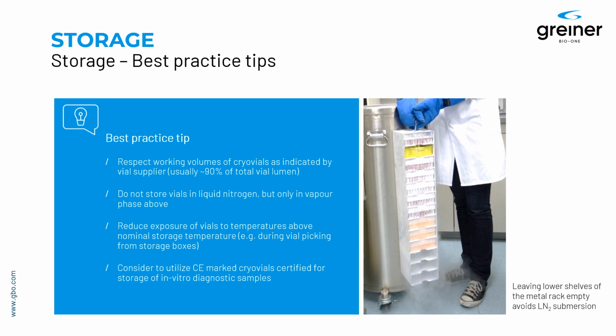And you can even think about automated storage devices, because they only retrieve the one sample that you need and everything else is kept at low storage temperatures. Last but not least, consider the utilization of CE mark cryovials, because they are certified and approved for storage of in vitro diagnostic samples.